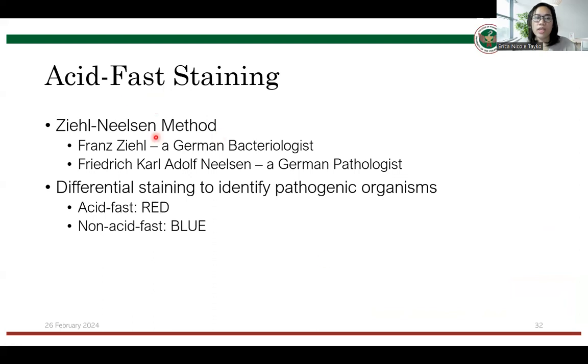So yung acid fast staining, otherwise also known as the Ziehl-Neelsen method. So that's why we call it the Ziehl-Neelsen method. It's because the method was developed by two scientists.